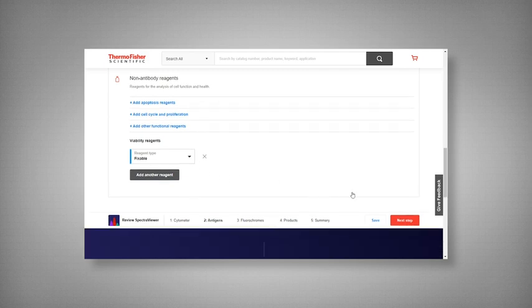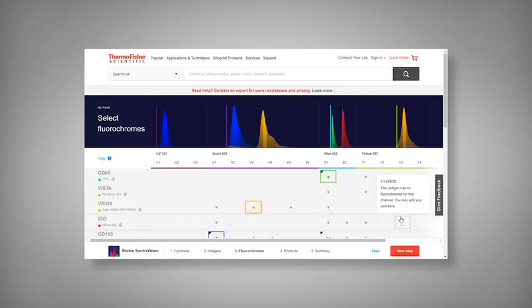Now our next step, picking the fluorophores for each specific antibody. Now, it is a general rule of thumb that low-expressing or unknown targets should use brighter formats, while high-expressing targets dimmer formats. Brighter is not necessarily better, as that can result in spreading error. Now, if we go back to the protein abundance, CD68 we indicated high.